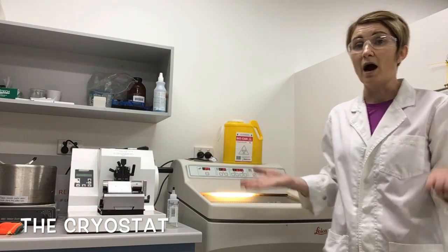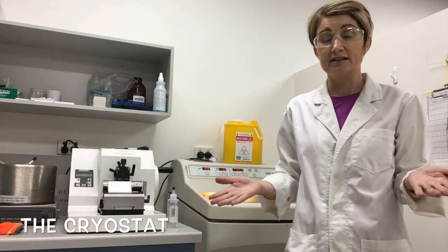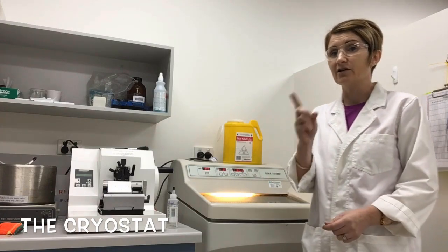Now you're probably wondering why would we want to cut fresh, frozen samples? Well, if you stick around, I'm going to tell you in a minute.